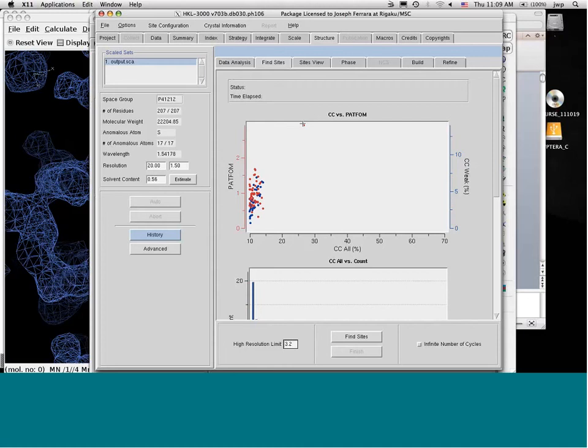Well, that's an interesting question. If you're looking for sulfurs and seleniums, the longer you collect data, especially at some of these hot beamlines, you will have radiation damage, and the sulfurs and so on can move around. That may be an opportunity to use iodine, because I don't think you're going to get radiation damage with iodines. They're not going to move around very much. You might change their occupancy and so on. So it's a trade-off. If you have more redundancy, you may have more radiation damage, and it may be harder to solve the structure.